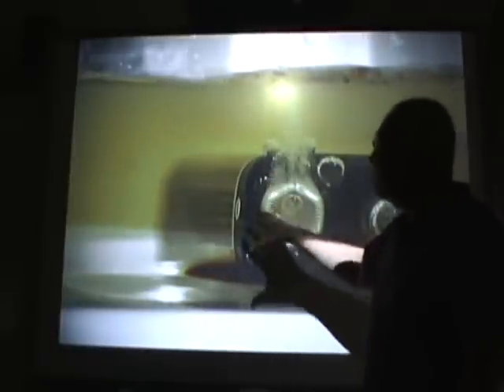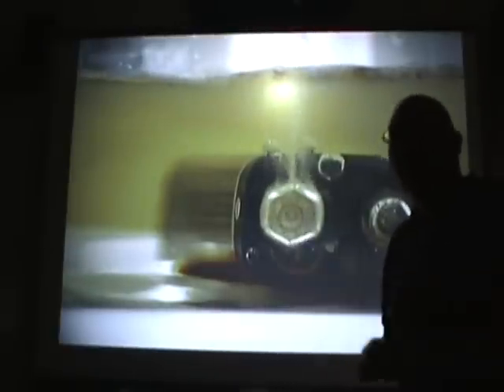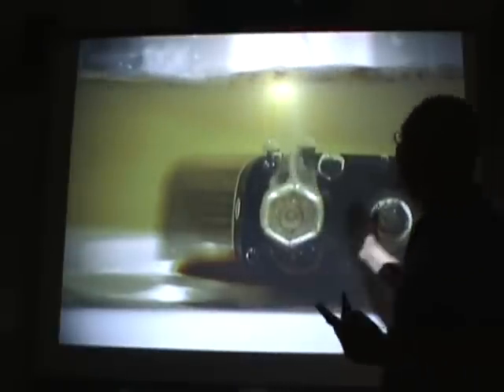All right, now, to prove that potassium hydroxide is being formed here, as the potassium forms and immediately reacts with the water, we'll add our old friend phenolphthalein. I didn't want to add it before because it might interfere with this lovely yellow. Oh, forget it. I like to interfere with it. I don't like that color. Phenolphthalein. And I'm ready. Boom. Looky, looky. Isn't that just the gosh darn prettiest thing you've ever seen in your whole life?